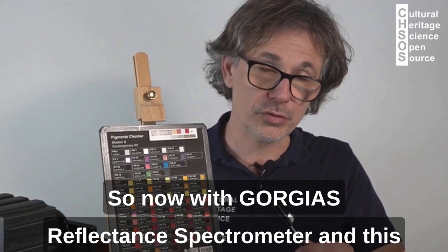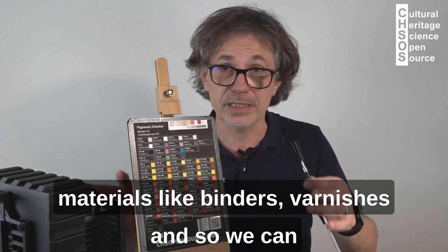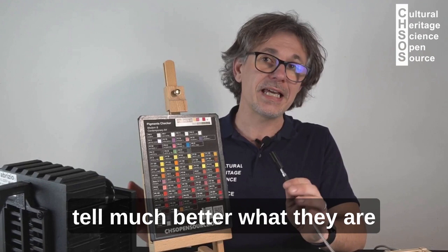So now, with the Gorgias reflectance spectrometer and these fluorescence kits, we can have a measure of the fluorescence of pigments and other art materials like binders and varnishes, and we can tell much better what they are. It is a very useful technique to start to do identification of these materials.